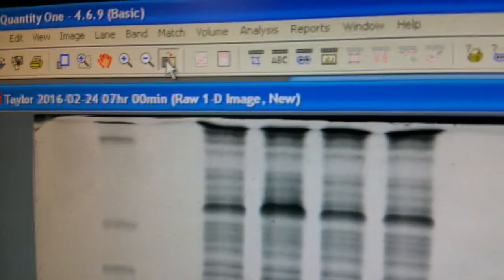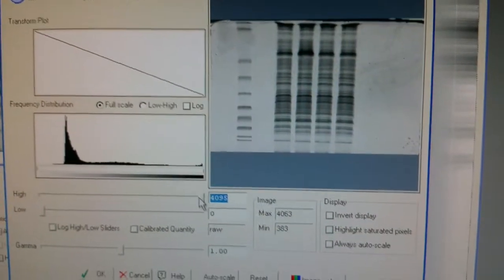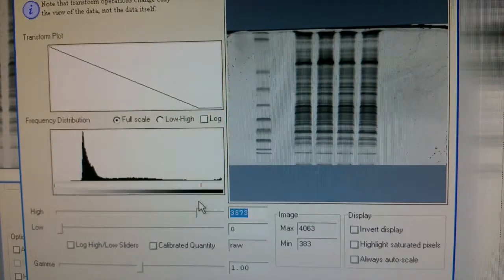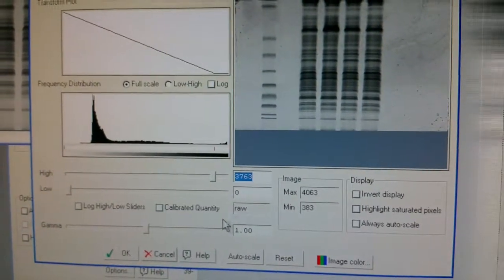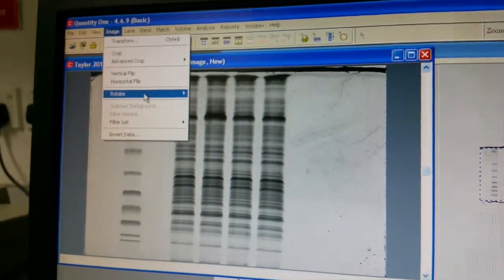Press this little bar just under the image. Here you can adjust the intensity of the image — it can be made darker. Usually we put around 700 to 3700. Then click OK. To flip the image, go to Image and then Rotate — or rather, Flip Vertical. Click Flip Vertical, say Continue, and you have it.